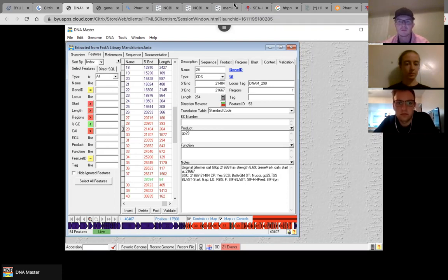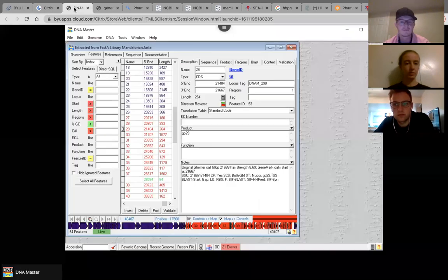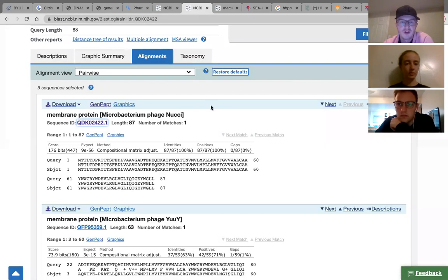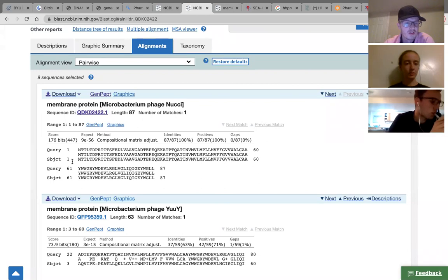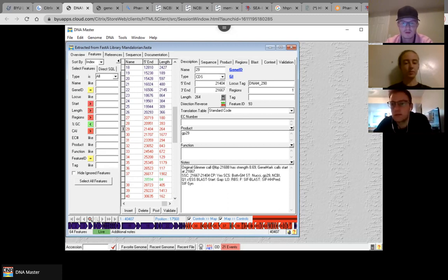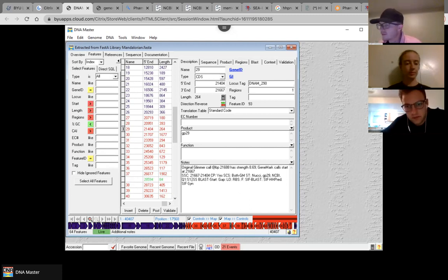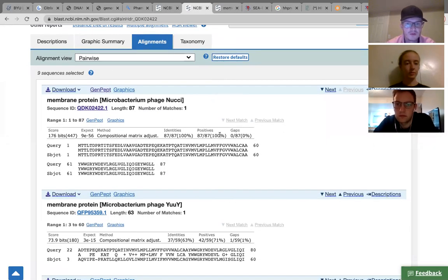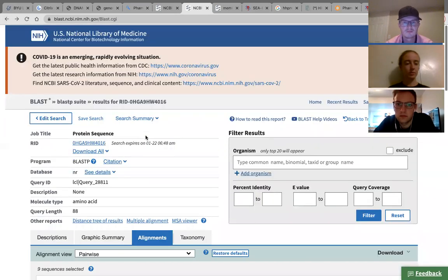And then it asks for the database. If you remember, we're in NCBI, so we will put NCBI. And after that, it asks for the query and the subject. We can see the query and subject is 1-to-1, so we are going to put Q1 colon S1, big S. And comma, it is also asking for the percent alignment, I believe, which we can see here is 100%. I think it also shows it on this original page.